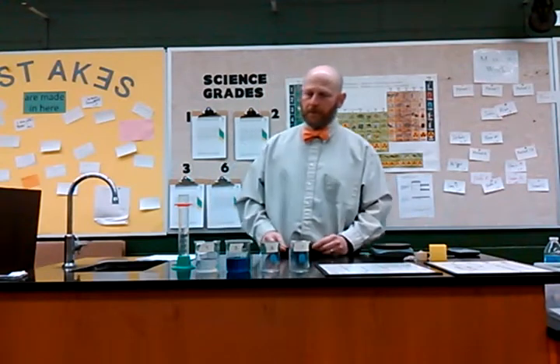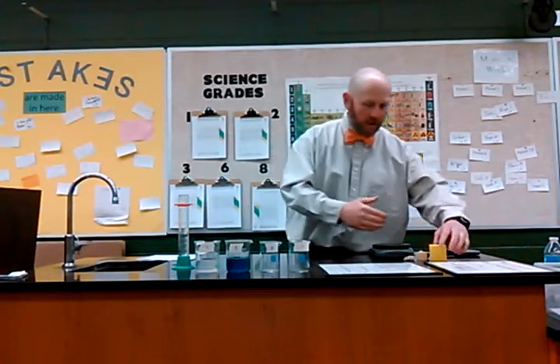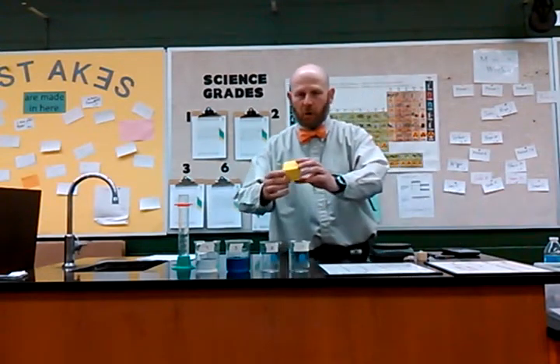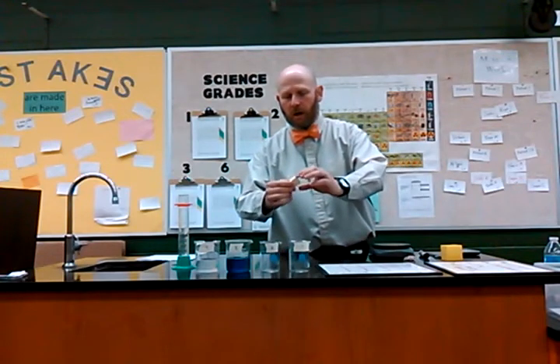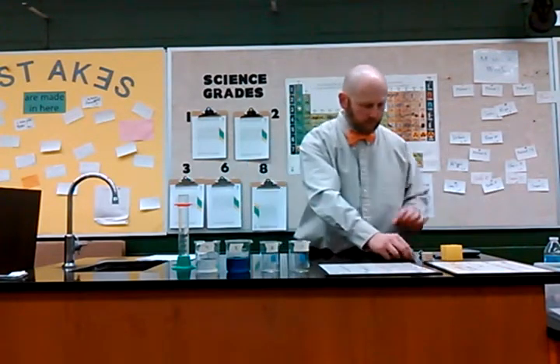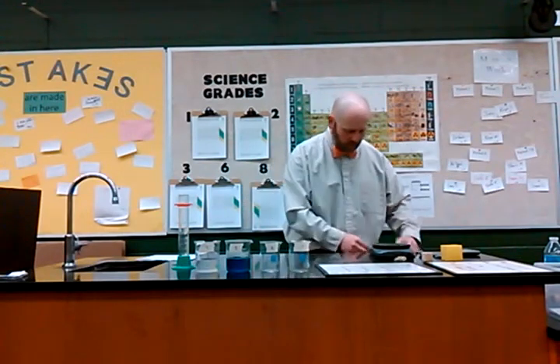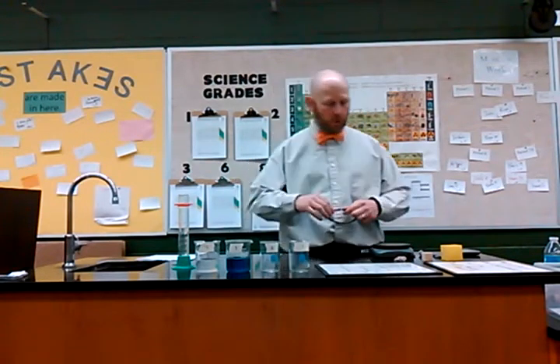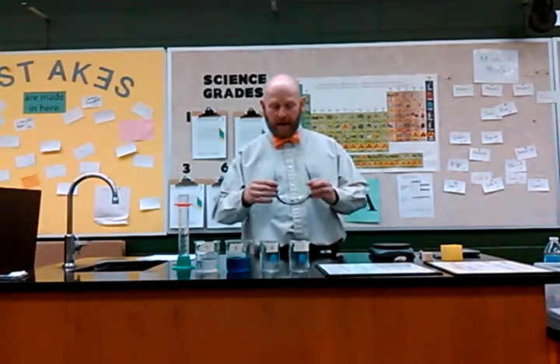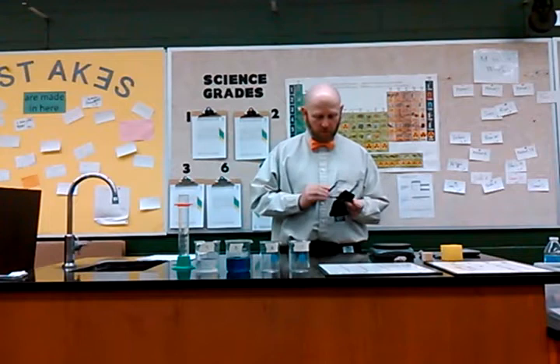and we will calculate the densities of those liquids. Now, our other materials are a yellow foam cube, a cube of wood, and a rock. And because safety is always a consideration in almost any experiment, because I have salt and sugar water, I wouldn't want something to splash up in my eyes, so I will wear a set of safety goggles to ensure that that does not happen.